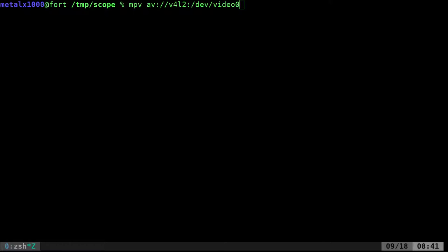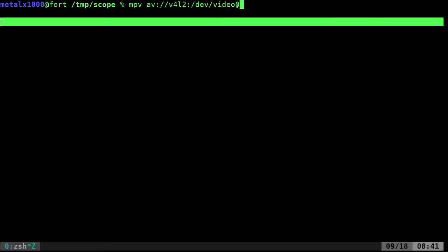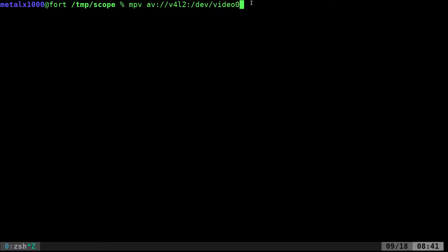You can use any webcam software like cheese or GUVCViewer, but I prefer MPV for almost all my media stuff. For that you type MPV AV for audio video using video for Linux 2, then your device which in my case is video zero because it's the only webcam I have. If you have more than one webcam the number might change.